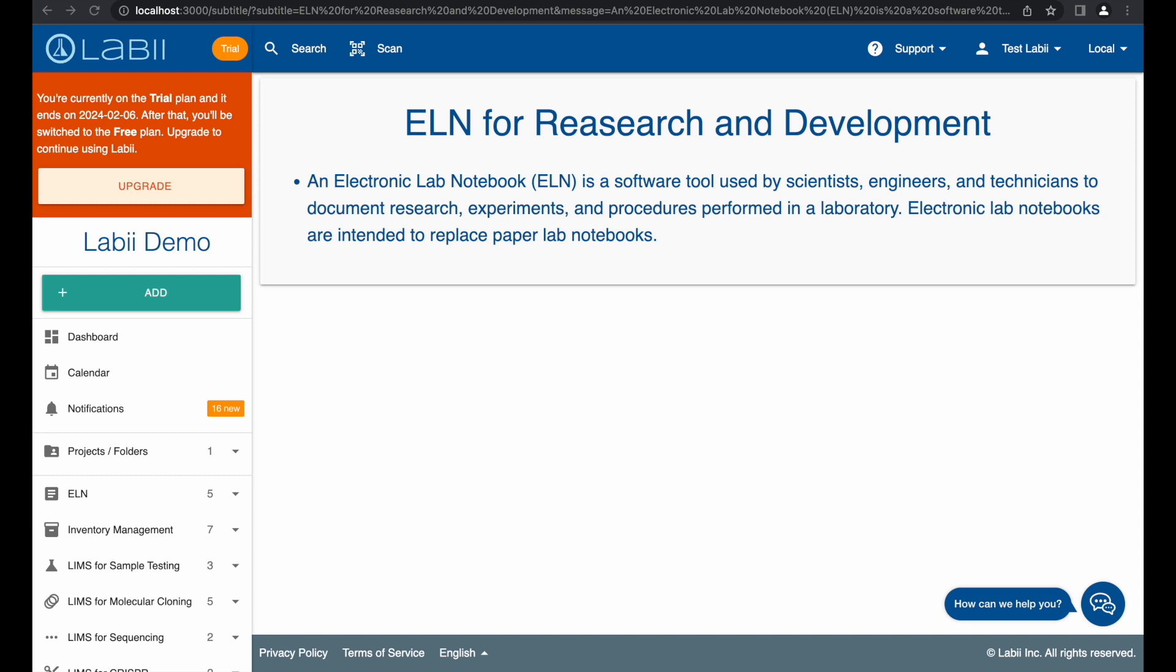In this demo, I will show you how to use Labii as electronic lab notebook in R&D. Research and development typically focuses on innovations and proof of concepts, often using a small set of samples. As long as the data generated by researchers can be replicated by other scientists and meets all regulatory requirements, there is no need to document every detail.